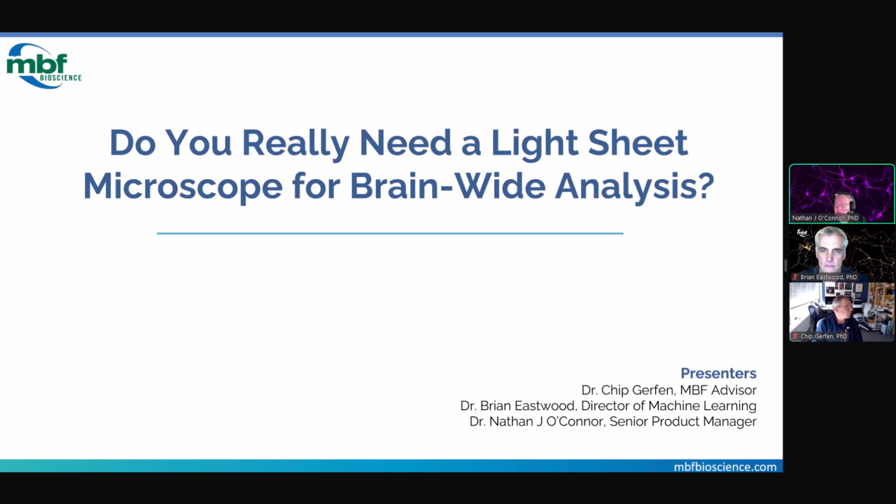Do you really need a light sheet microscope for brain-wide analysis? We'll explore using serial sections for brain-wide analysis. I'm thrilled today to have with us an expert in neuroanatomy and longtime MBF collaborator, Dr. Chip Gerfen, and also our Director of Machine Learning, Dr. Brian Eastwood. And I'm Nate O'Connor.